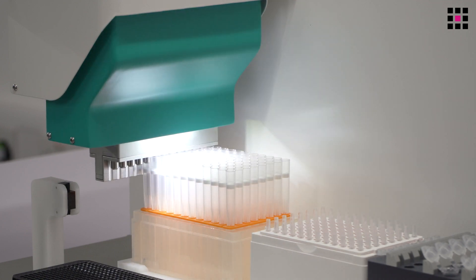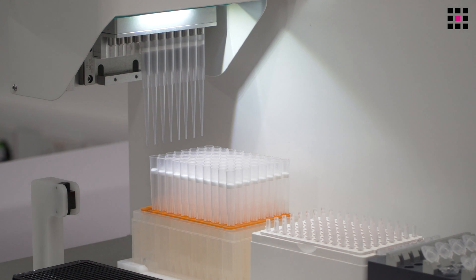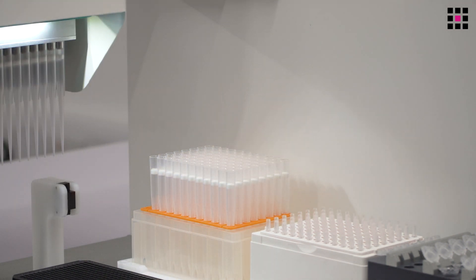Tip pick up is automatic. Users can choose whether they want to replace tips into the same tip box or whether to dispose to waste via the tip chute.